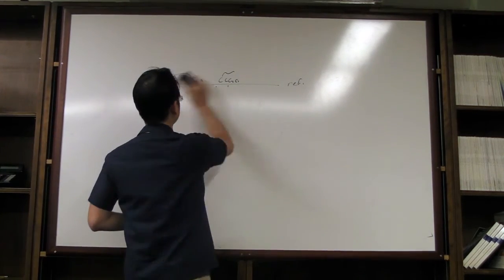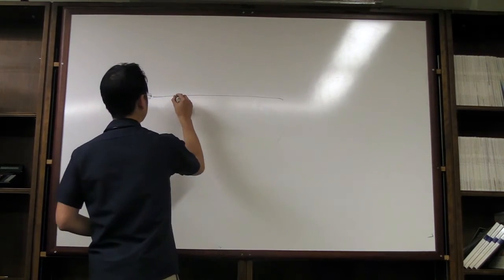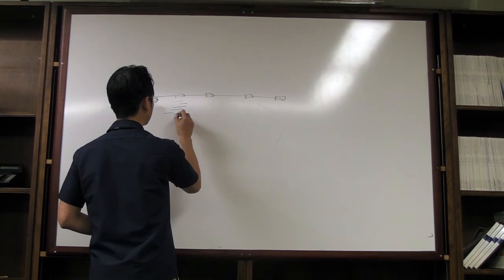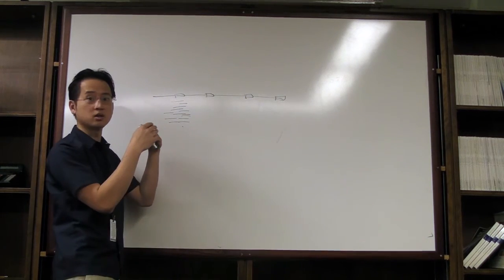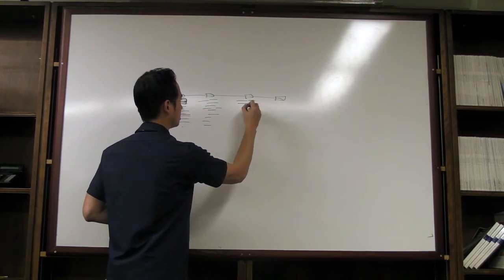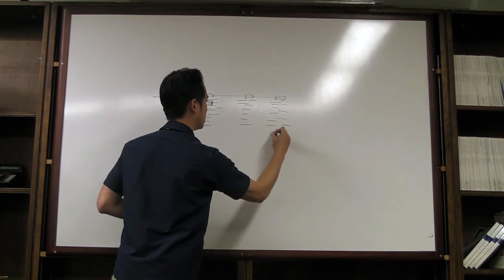So let's say you do map. And now this is your reference. These are your exons. And here are your reads. Determine that each one of these meets a minimum criteria of 80% match or whatever, and that the penalties are not so high that, yep, I am able to map it. These are my different reads mapping.